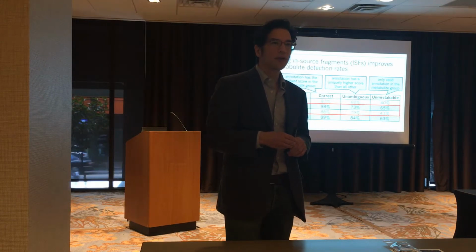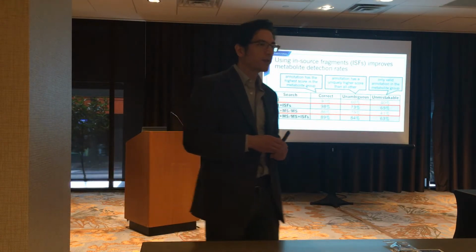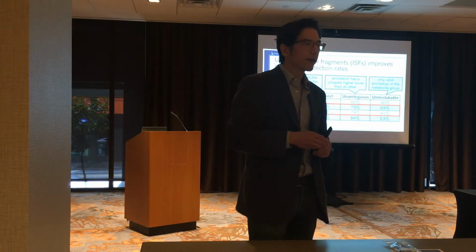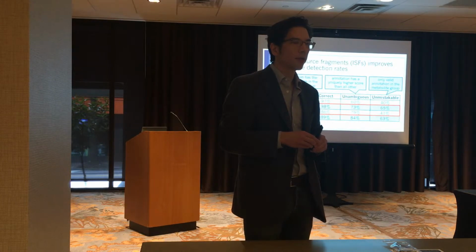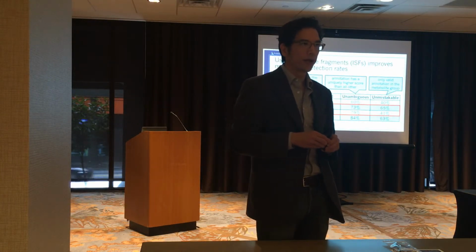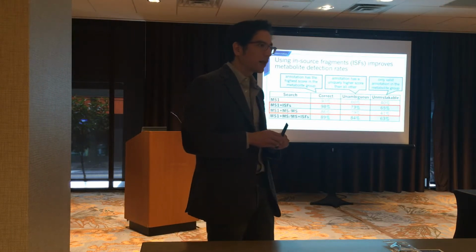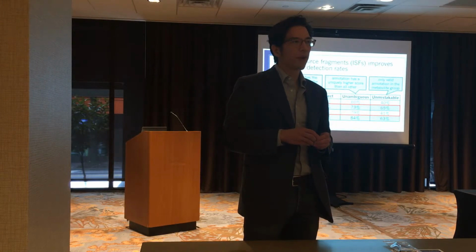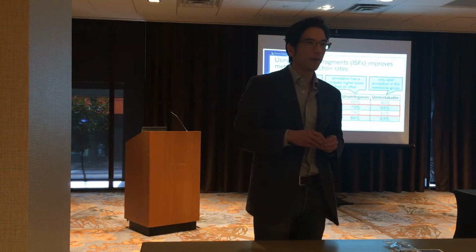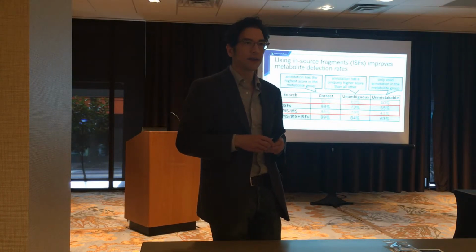And this was a little bit shocking to us, that if we were looking at MS1 only data, which frankly a big subset of the metabolomics community is still collecting and analyzing, we actually can be fairly confident with that data and use these spectrum libraries to identify metabolites out of it, as if you were collecting MS2 data, in a sense.